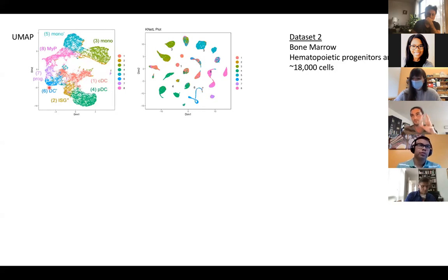You could maybe refer to this as the CDP population, for those familiar with the field. We looked for signs that there are individual cells in the CDP pool that are specifically primed to go in the PDC lineage direction, or the CDC1 or CDC2 directions. What we found was that there are clear signs of heterogeneity in this population, and because we had the CITE-seq data, the antibody tags as well, we found a couple of markers that were potentially useful in identifying these cells prospectively.